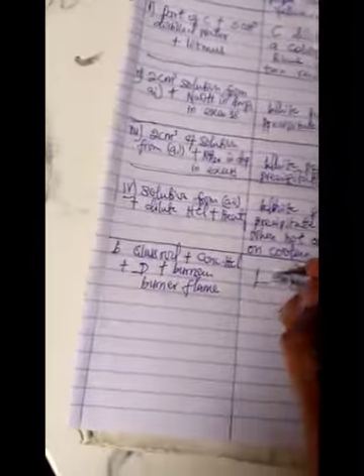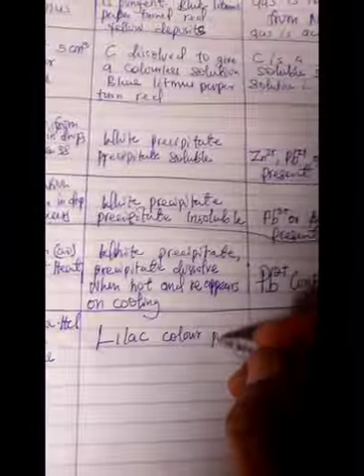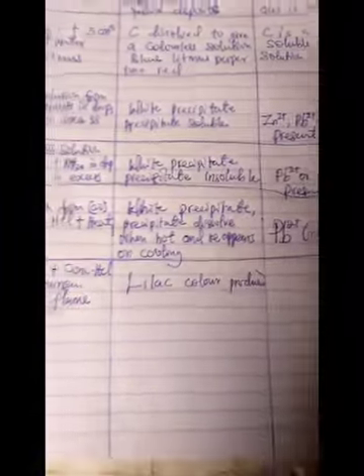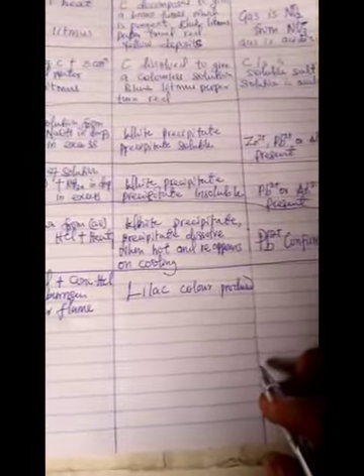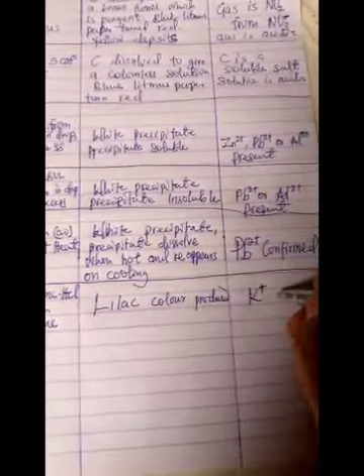What will you observe? Lilac color. So we'll say lilac color produced. That is what you will observe. And what would that show? It shows that potassium ion is present. You write it. Potassium ion is present. Then BII. We are winding down.